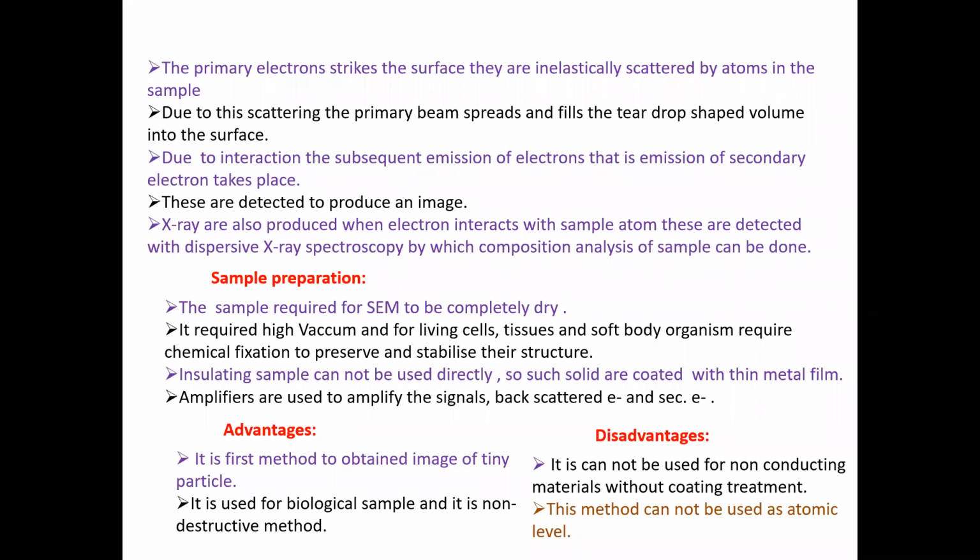तो सुटेबल सॉल्वंट म्हणजे एनएमआर मध्ये तुम्हाला जर CDCl3 असेल, तर ड्युटेरेटेड सॉल्व्हंट जे असतात त्या ड्युटेरेटेड सॉल्व्हंट मध्येच तो डिझॉल्व्ह करायचा असतो, अँड देन दॅट सॅम्पल प्रिपरेशन्स विच टेक इन टू द इन्स्ट्रुमेंट, असं एनएमआरचं आहे. तसंच सॅम्पल प्रिपरेशन इज व्हेरी इम्पॉर्टंट फॉर द सेम.